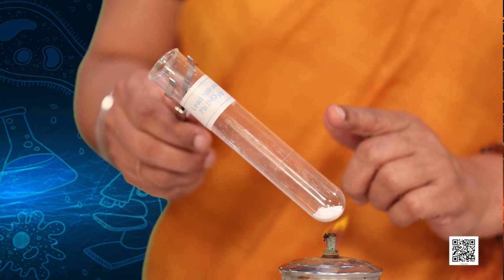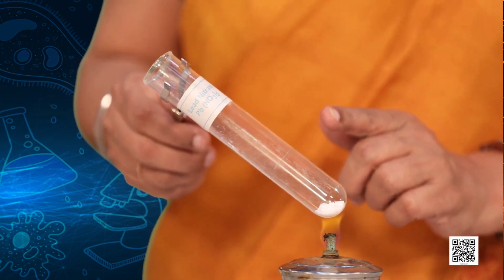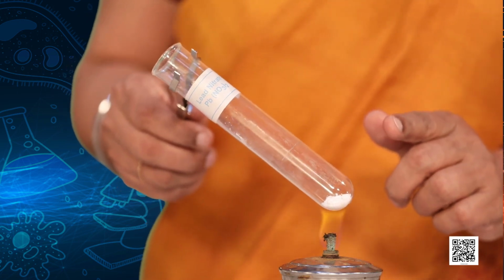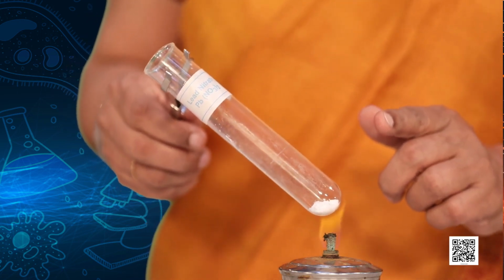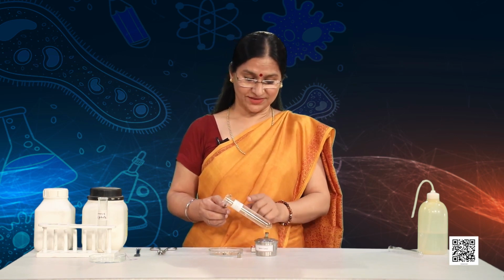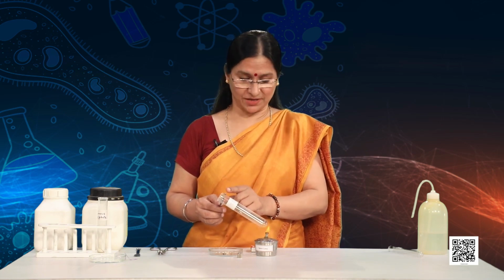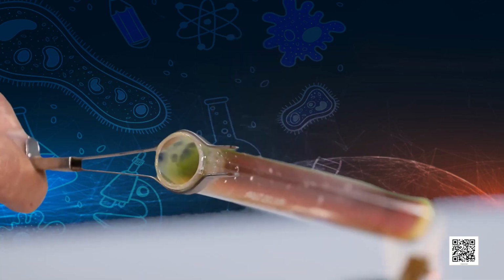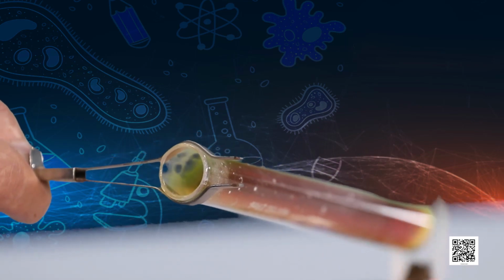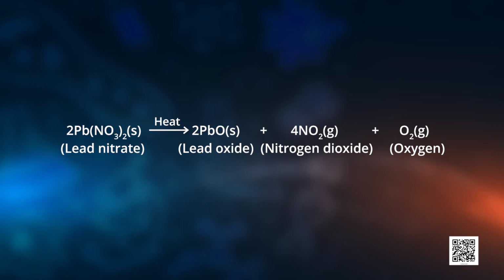And yes, children, always remember that the mouth of the tube should never be pointed at your neighbors or your own self. You have to be very careful. Emission of brown fumes can be seen. Look here and be careful. Never inhale them directly. They can be harmful to you. I hope you are noting your observations. These fumes are of nitrogen dioxide. Lead nitrate has decomposed into lead oxide, nitrogen dioxide and oxygen.